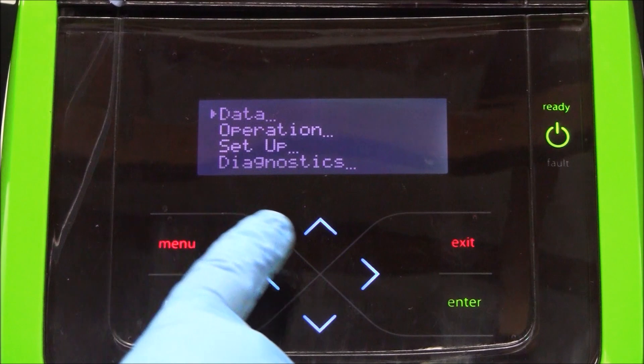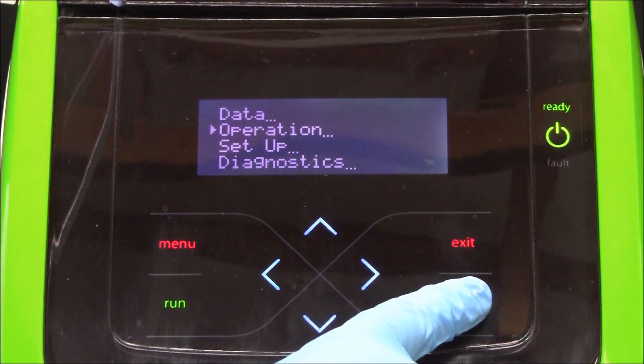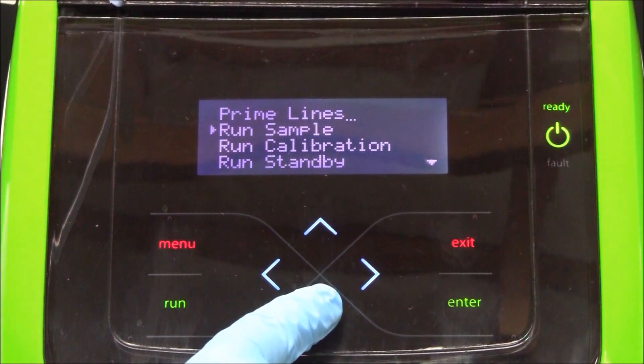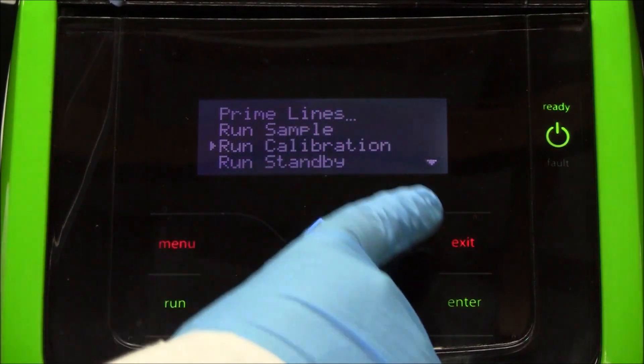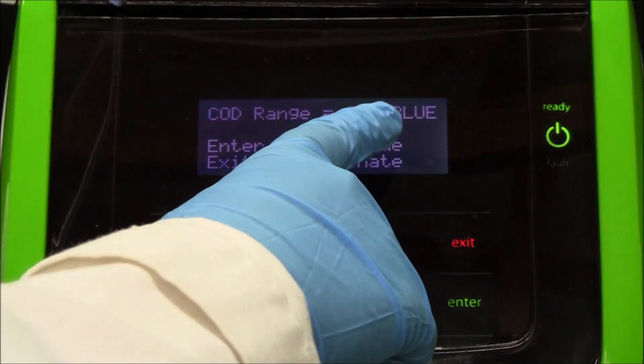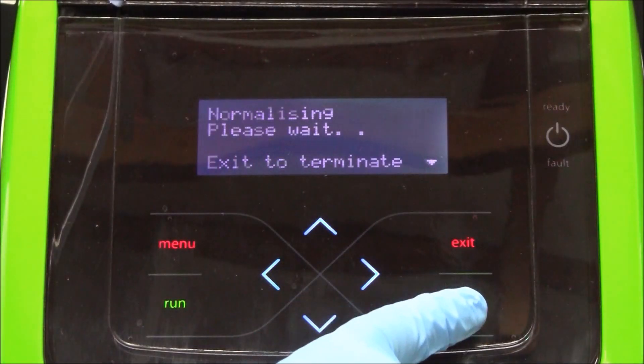In the operation menu, select run calibration. Verify the correct COD range is selected for your samples.